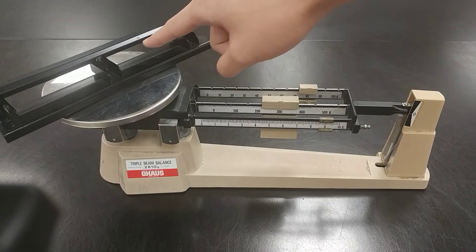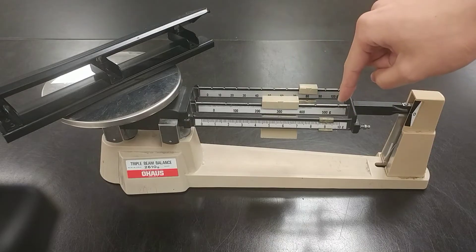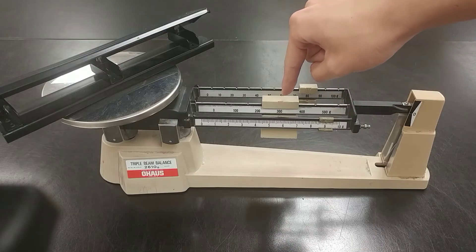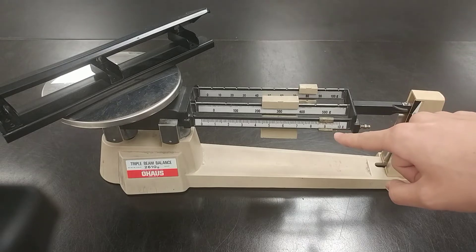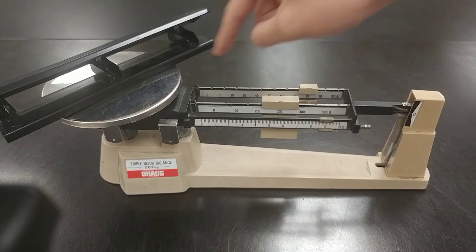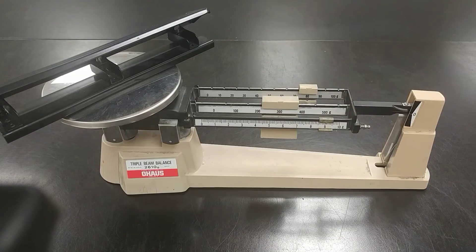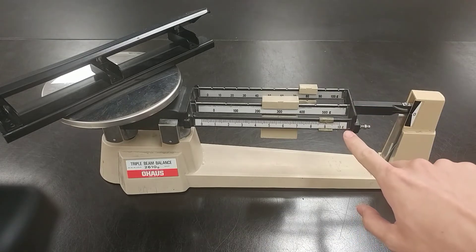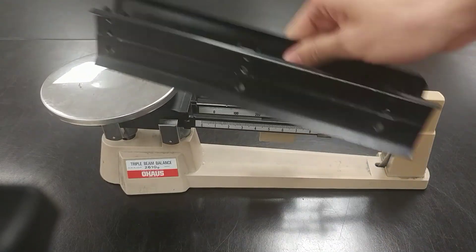To find the mass of this hole puncher, we need to add these three weights together. The biggest one is at 300, the medium one is at 80, and the smallest one is around 9. So the mass is 300 plus 80 plus 9, which is 389. G stands for grams, so it is 389 grams.